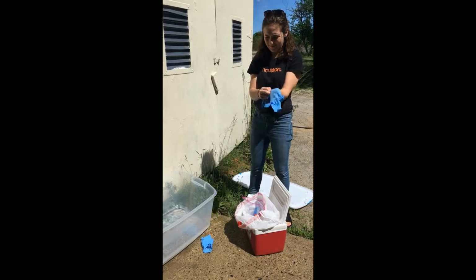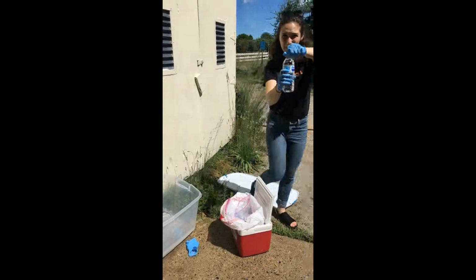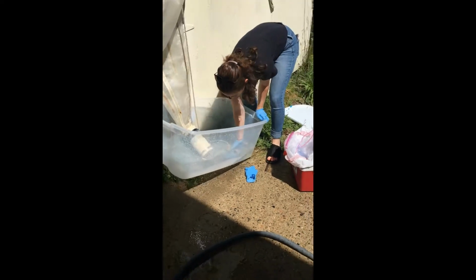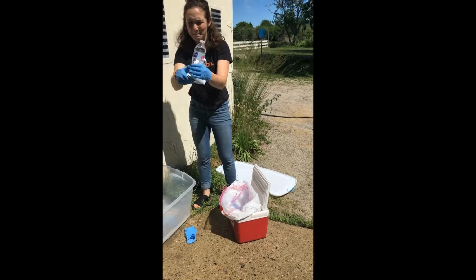You can see here the eDNA kit that's been prepared beforehand with a Nestle Pure Life water bottle. I'm going to fill up the water bottle just by dipping it in. Make sure I have clean gloves. And once you have it capped, just tip it over and pretend to squeeze it a little bit. Make sure nothing gets out and everything's secure.